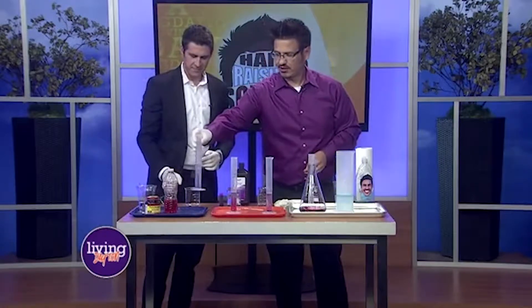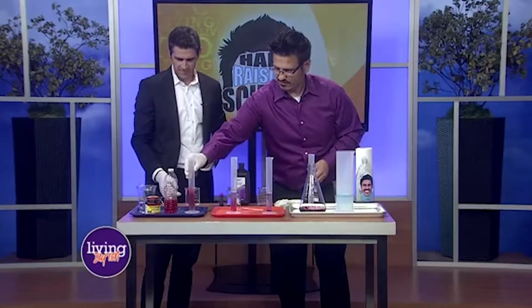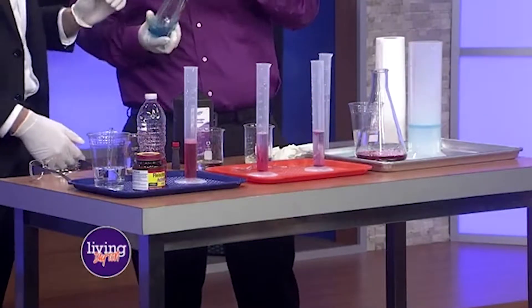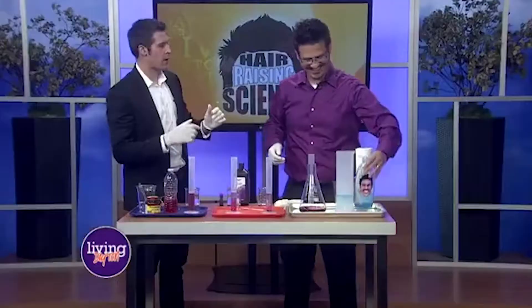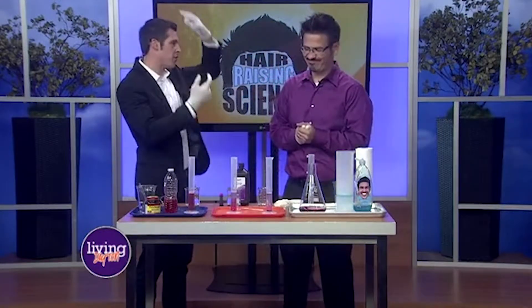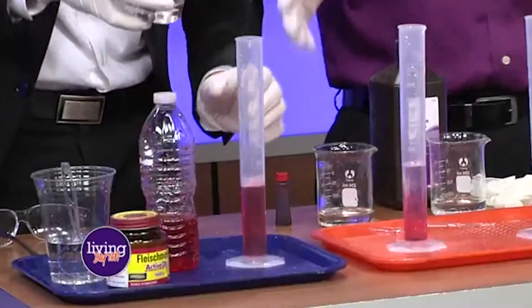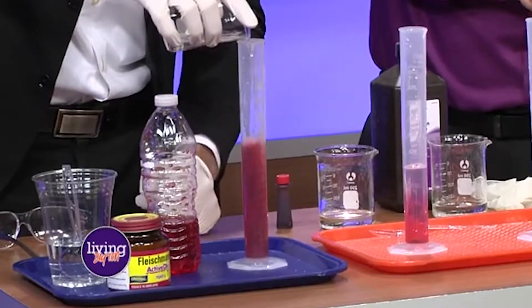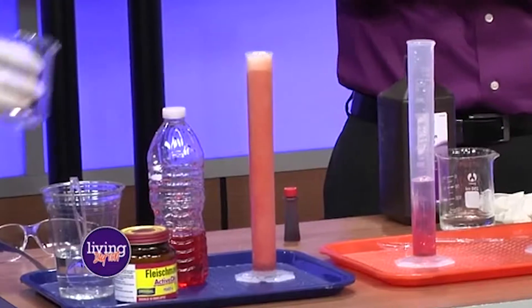I have a solution I want you to pour into this graduated cylinder. I'll stir it up — and right before we started, I squirted some soap in. Soap, of course — your favorite! We've got it stirred up, so go ahead and pour that in, then back off and we're going to watch it do something. It's going to start foaming up. That's six percent, and this is what you can do at home.